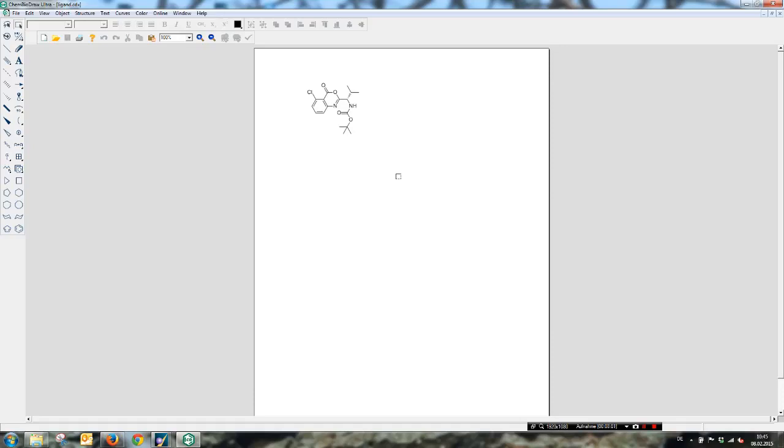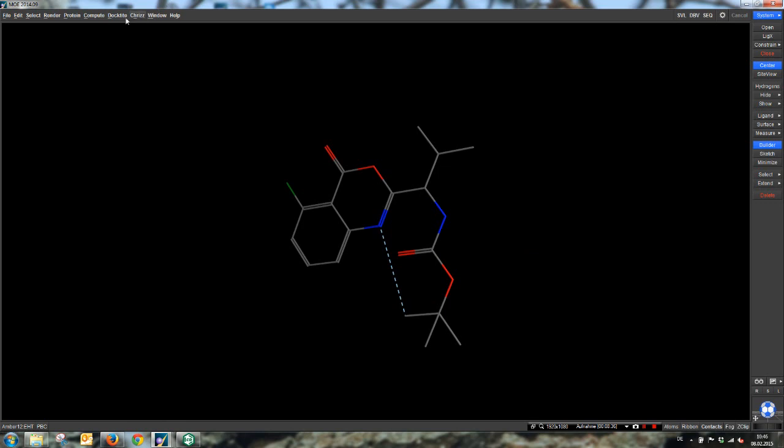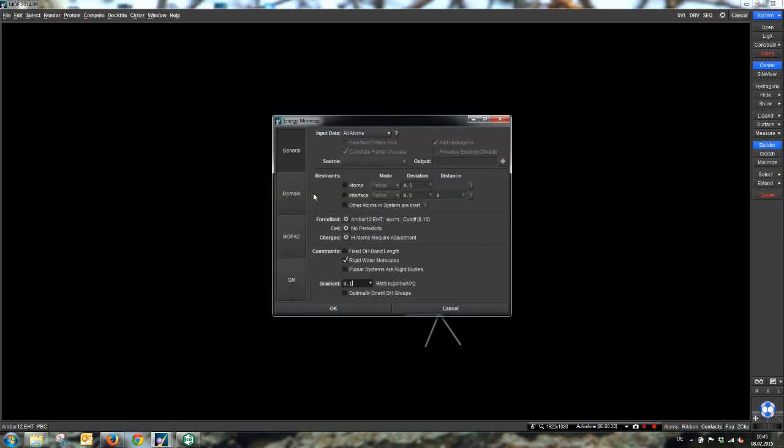as there is information stored in the ligand because it comes from the PDB. It has the position of the original structure, and this is not the right way to do it. You should give no information of the real pose before you make the pose prediction. So we sketch it in ChemDraw, for example, and we just copy it into MOE with Control C and Control V. Now you see this is flat, and we will just make a short energy minimization.